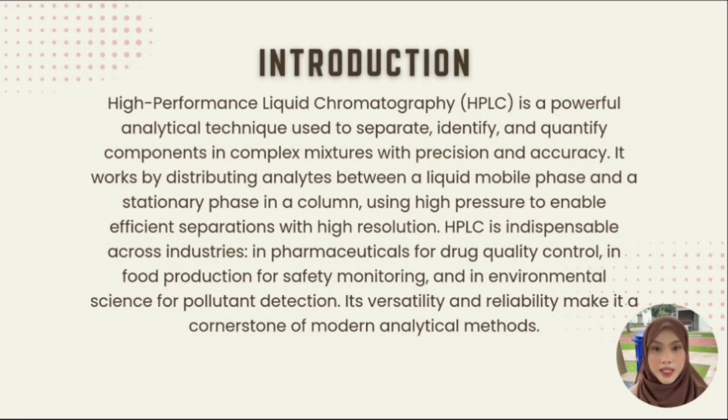Welcome to this introduction to high performance liquid chromatography or HPLC. In this video, we explore what HPLC is, how it works, and why it's an essential tool in modern analytical science. HPLC stands for high performance liquid chromatography. It's a technique used to separate, identify, and quantify components in a mixture. It plays a crucial role in analyzing complex samples with precision and accuracy.